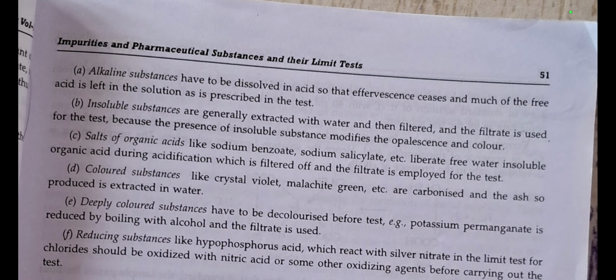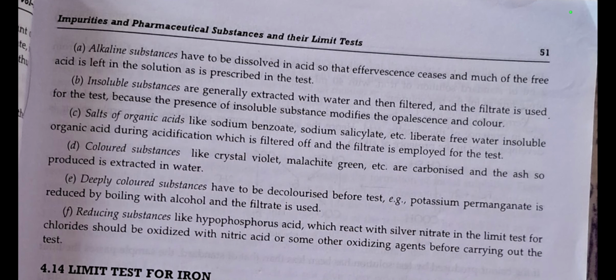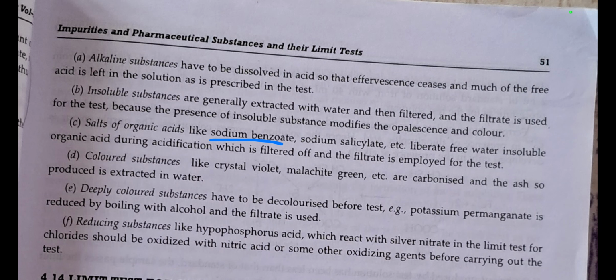Next, in the case of salts of organic acids, for example sodium benzoate and sodium salicylate, we first liberate the free water-insoluble organic acid by acidification, which is filtered off, and then the filtrate is employed for the test.